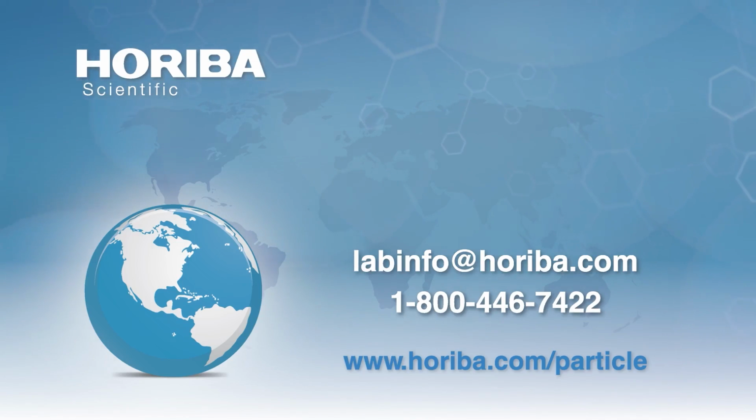Thank you. Okay, so this person has more specific questions regarding the software. We can definitely address that privately using labinfo@horiba.com, and we'll reach out to you as well. But basically, he's wondering if the software is compatible with, say, a LIMS package. And the second part of that question is, is there an automated auto sampler that would allow you to measure samples in a high loading, high speed manner?